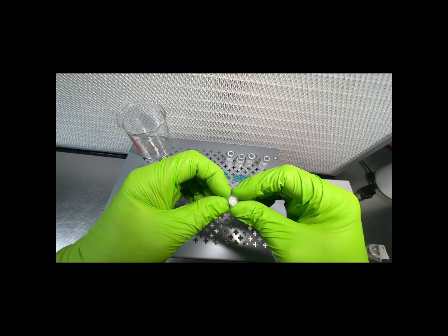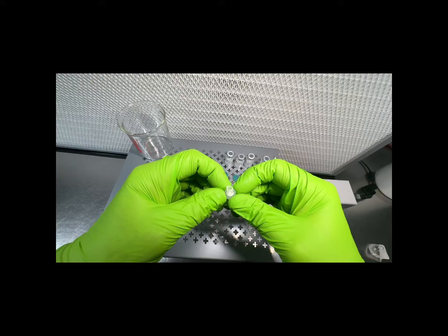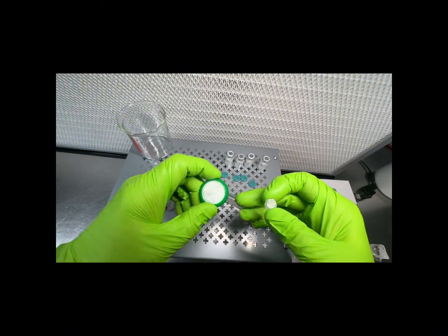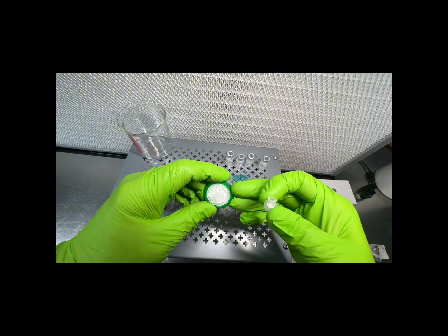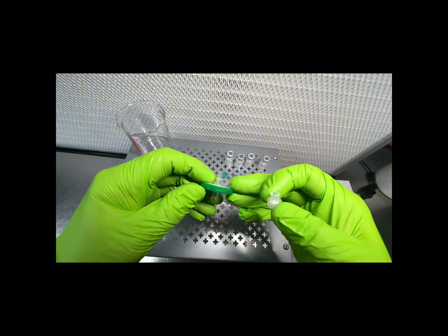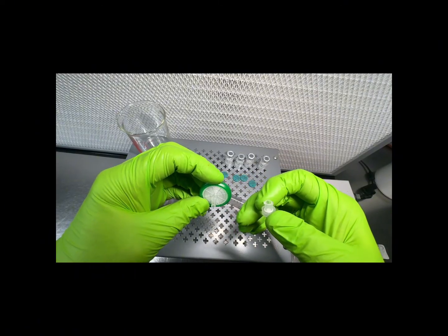The next size up at 13 millimeter holds about 0.28 milliliters, and a guy like this would hold somewhere in the neighborhood of 0.67 milliliters. So if you're only filtering, say, 1 milliliter through, this would end up holding 2/3 of your entire solution.